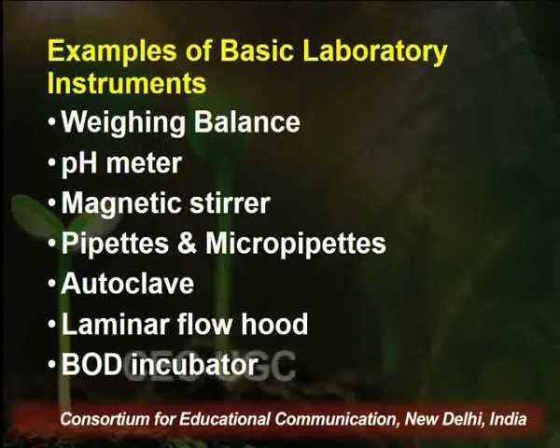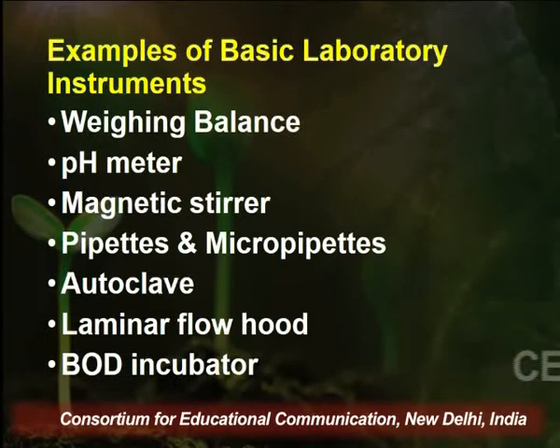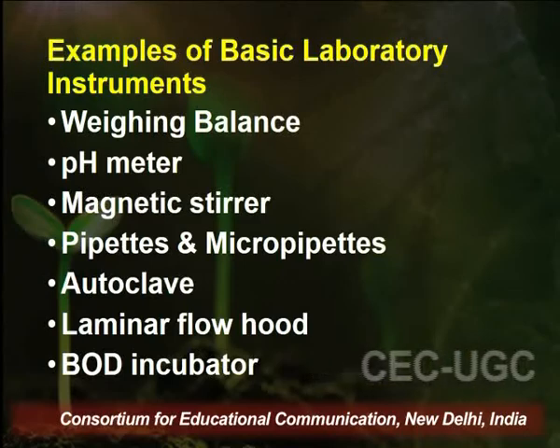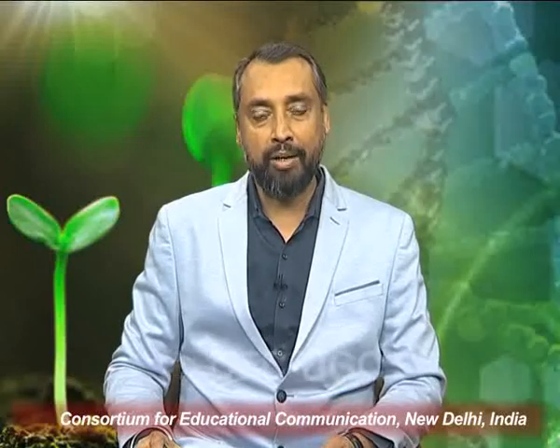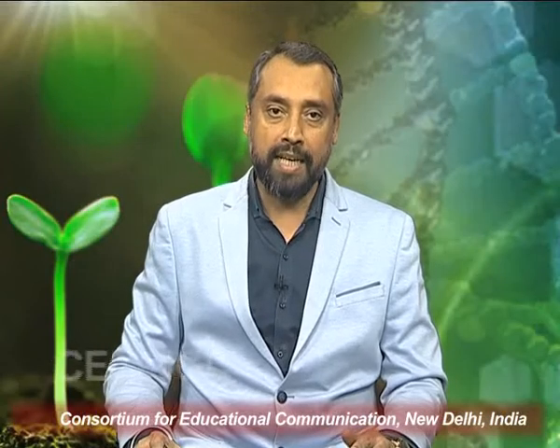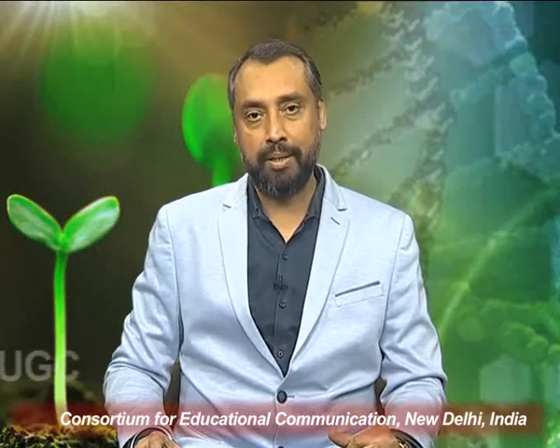The pH meter is another basic instrument to measure the potential of hydrogen ion in any solution. Then there are the magnetic stirrer, pipettes and micropipettes, autoclave, laminar flow hood, BOD incubator. The list continues with incubator shaker, micrometer, hemocytometer, spectrophotometer, agarose gel electrophoresis unit, SDS-PAGE unit, centrifuge, distillation unit, conductivity meter, lux meter, etc.